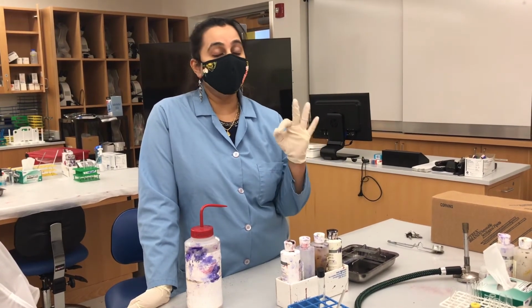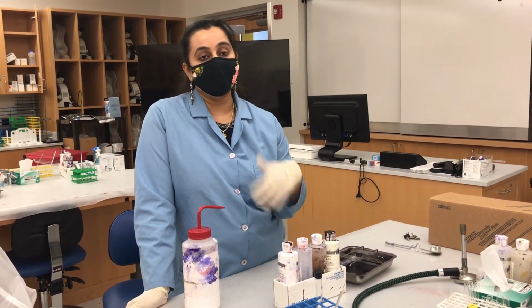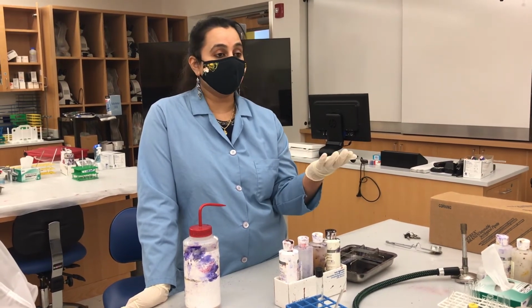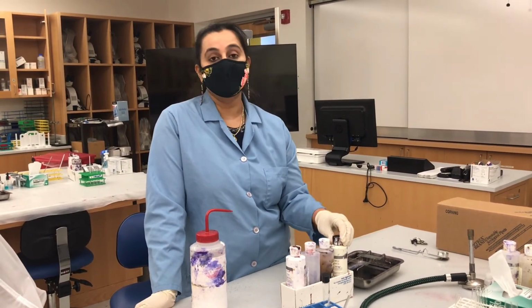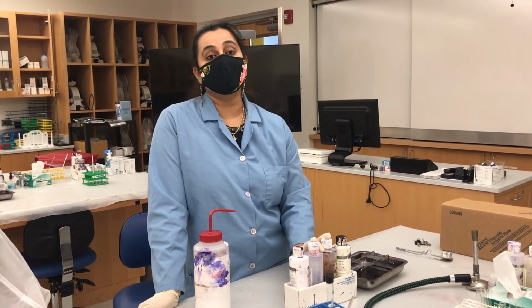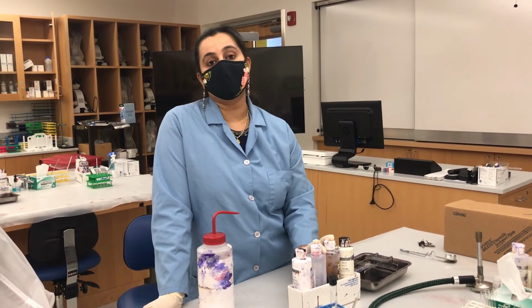There are many bacterial cells that will never take up any of these stains. They are atypical cells, especially, I don't know if you remember, I already mentioned some of these pathogenic strains like Mycobacterium tuberculosis. They can never be stained using simple crystal violet and safranin. You have to use a special stain known as acid-fast stain to stain pathogenic cells like Mycobacterium tuberculosis.